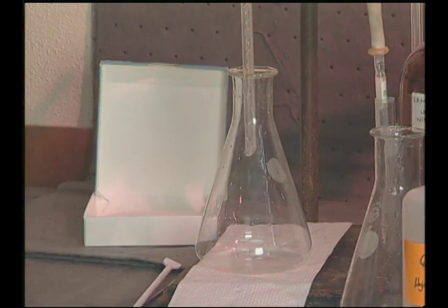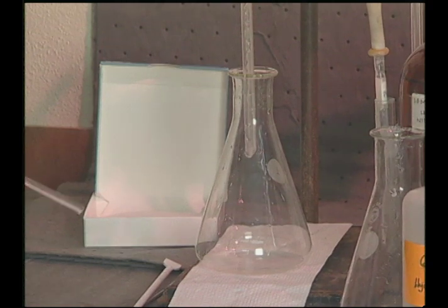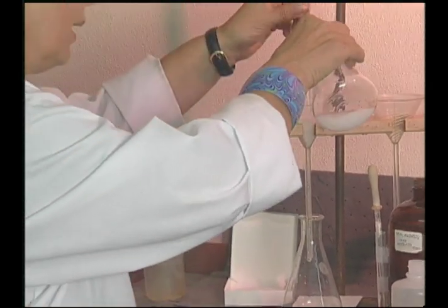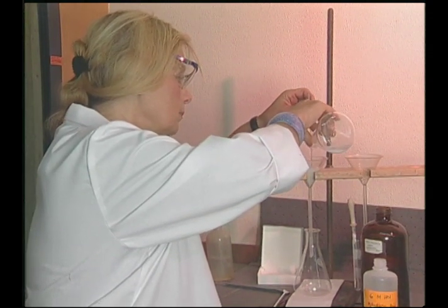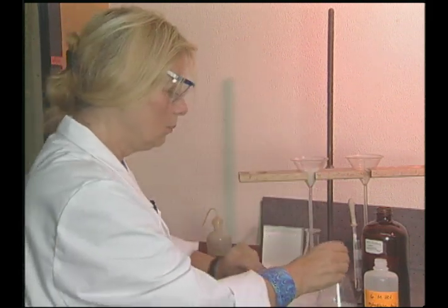If it's not clear, you have to filter it again. So you have to be very careful in filling the filter paper with this solution. And you wait till it goes down a bit, and then you pour a little bit over again. And on until the whole material is separated out.